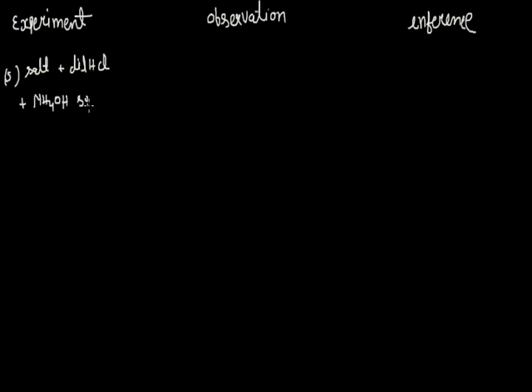If PPT is dissolved, then it indicates Ag+, but when we are adding NH4OH solution, it turns the white PPT into black due to the formation of the black PPT.